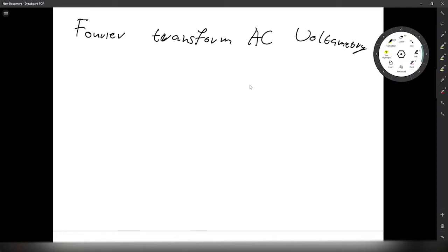However, it should also work for DC voltammetry, but the main focus has generally always been the use for FTACV, due to it just being more accurate and more of a focus for our research group.